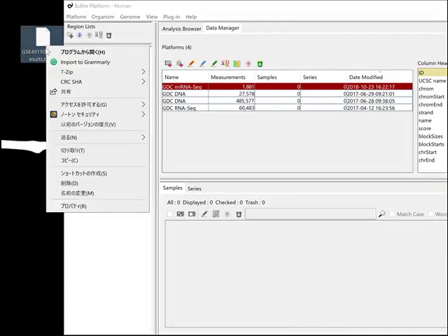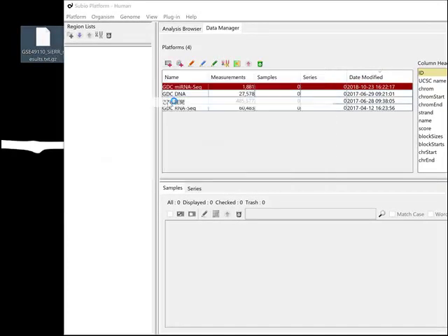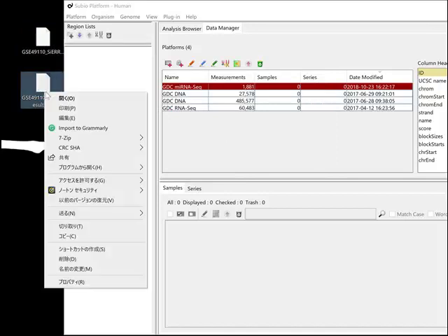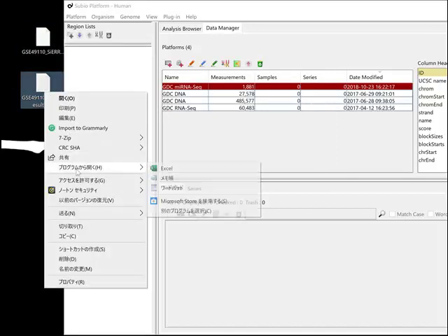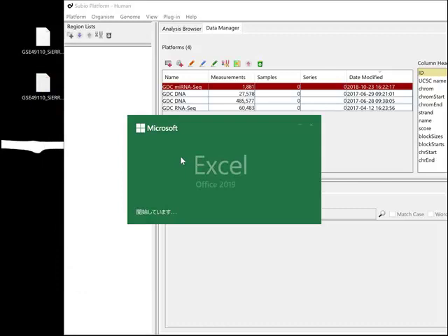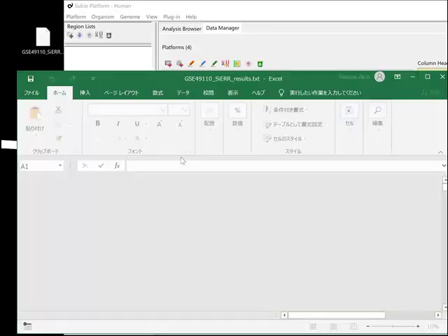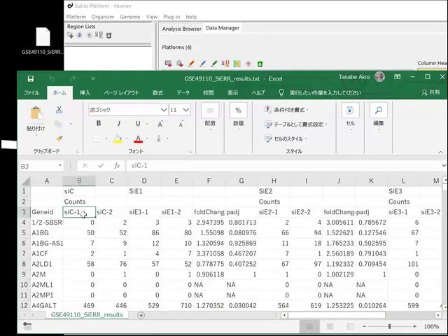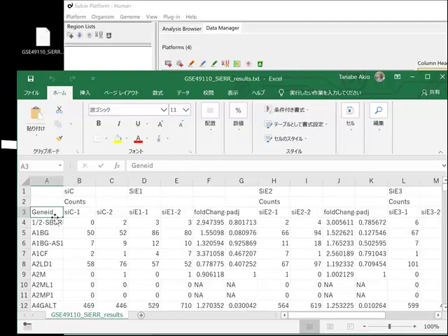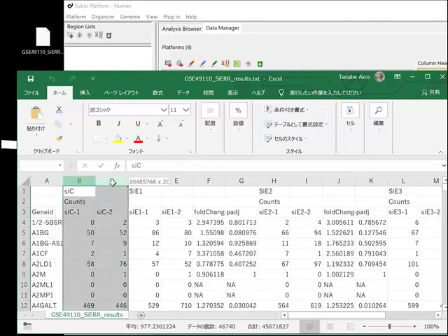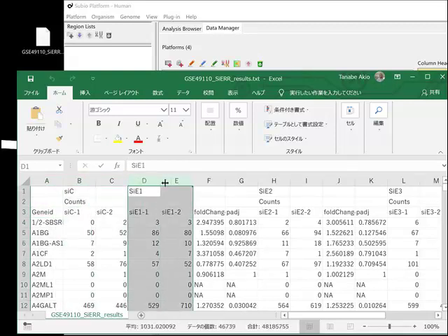Uncompress the GZ file and open the extracted text file with Excel. It contains gene symbols as IDs and counts. You don't use other columns of statistics.